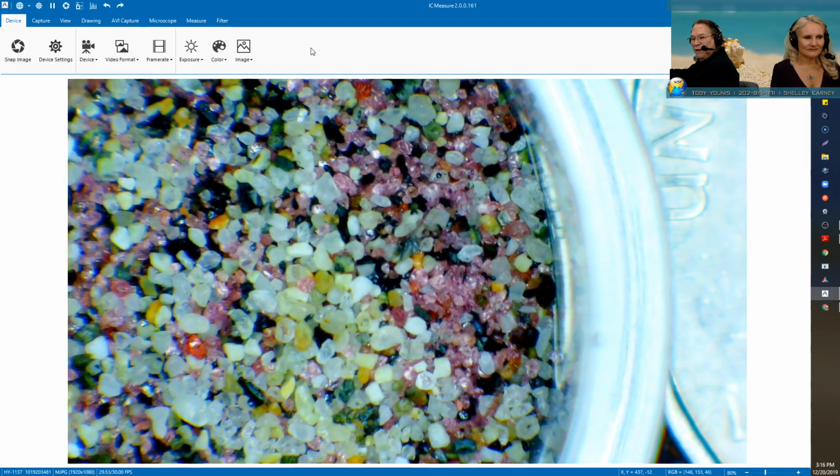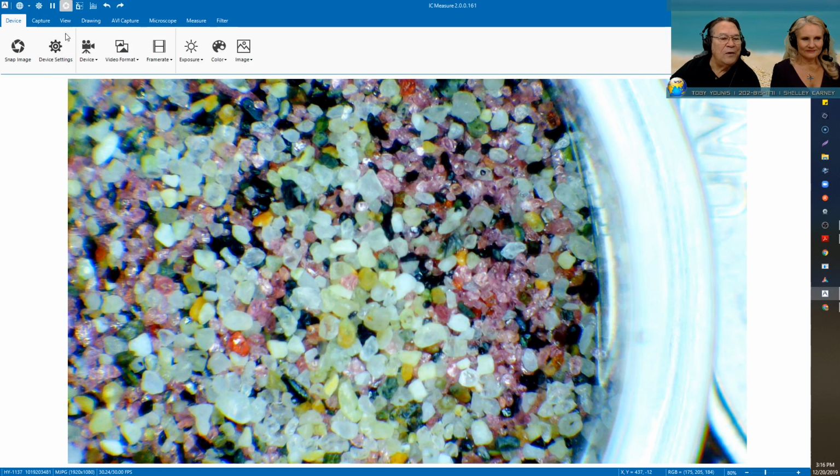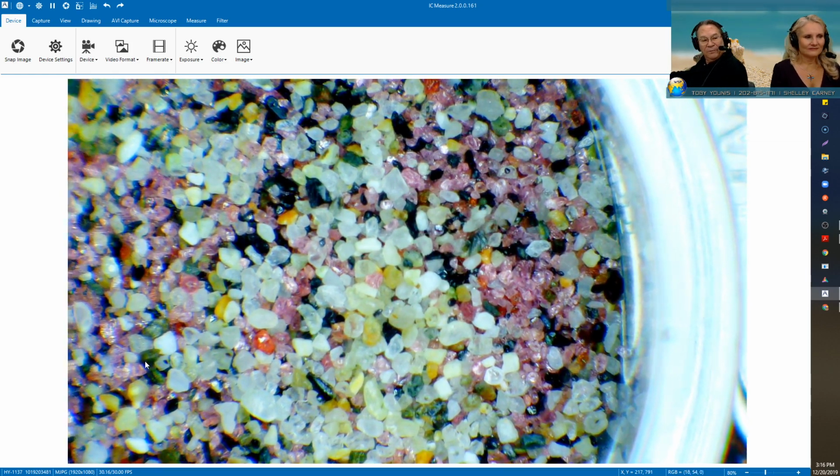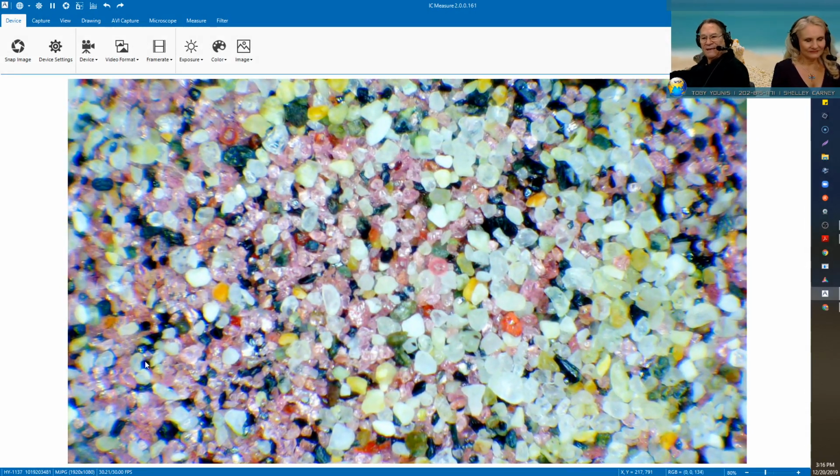But you can see right there, it's been changed a little bit, but you can see right there where the pink and colorful grains separated from the white quartz grains. And then as you go across, you'll see the other bigger separation. I mean, it's really pretty obvious. If you were to take a sample from it, this is the pink side and this is the white side of that little miniature quartz bowl that I've got it in.